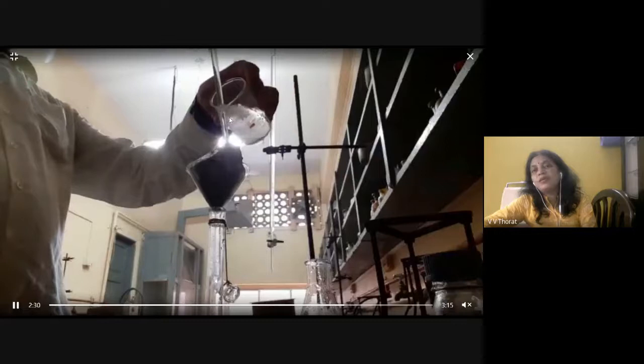When you transfer solution from a beaker, anytime you should use a glass rod. Why? Because the last drop will flow along the glass rod into your funnel. Otherwise, if you don't use a glass rod and just transfer, the last drop will flow out along the sides of the beaker. Always while transferring, use a glass rod. The solution will flow along the glass rod.